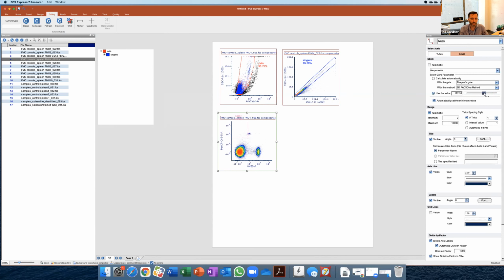And so now you see that, okay, some people prefer to see it like this. It's more recognizable. They feel more comfortable with that. Looks nicer. But really, what we're doing is just changing the scaling. So the data is still the same. Notice that the gates adjust also. So nothing changes. It's just the way we visualize the data. So you're not, in this case, manipulating or changing the data, right? You do have to be careful, because a lot of these things that we do, we tend to recognize patterns, etc. And by changing the scale, you may not see some of the patterns that you're used to. So be careful with that.